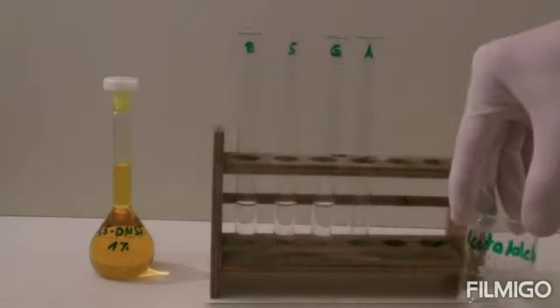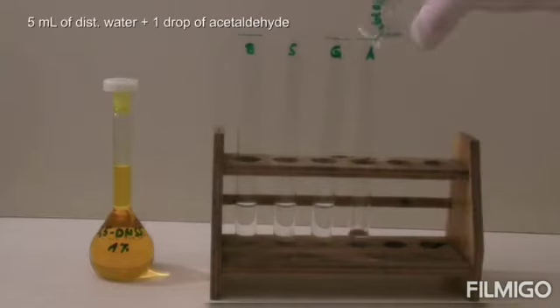In the last test tube, that is the acetaldehyde test tube, we have to add 1 drop of acetaldehyde along with the 5 ml of distilled water.